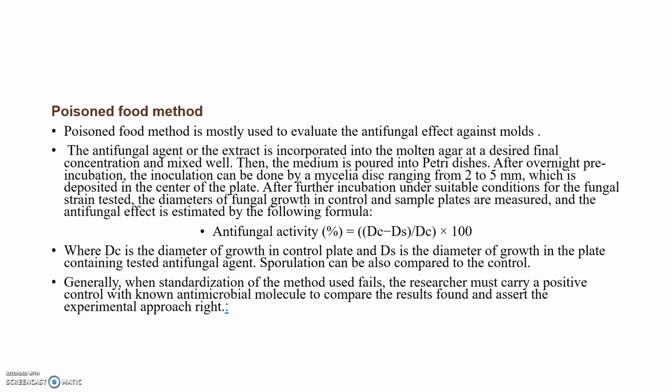After further incubation under suitable conditions for the fungal strain tested, the diameter of the fungal growth in the control and the sample plates are measured, and the antifungal effect can be estimated using the formula: antifungal activity equals dc minus ds by dc, into 100.